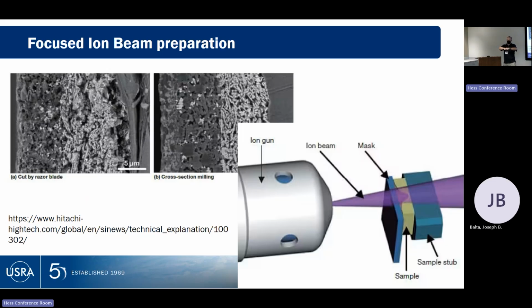For transmission electron microscopy, where you're literally blasting a beam through the sample and almost effectively seeing individual atoms, this is often done because you want a very thin sample to blast electrons through it. For SEM it is done sometimes because you can get a nice fine slice through something, and if you're trying to expose a single crystal that's right in there, okay, slice through this, and now I've got that crystal exposed. Now I can manipulate it inside the SEM.